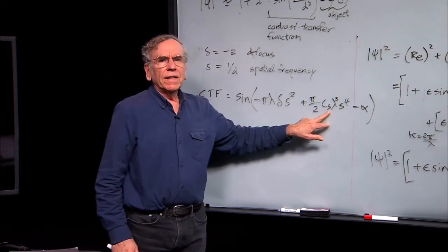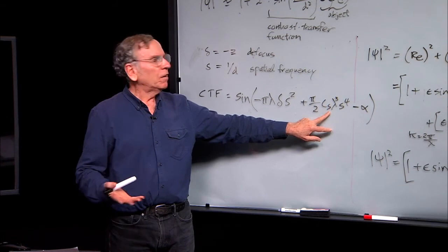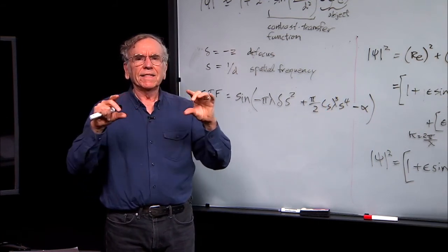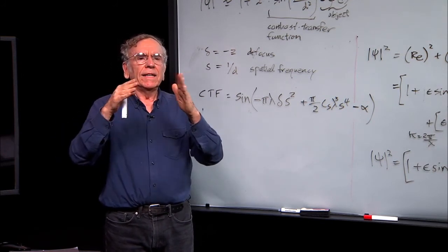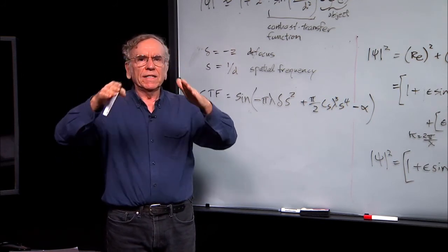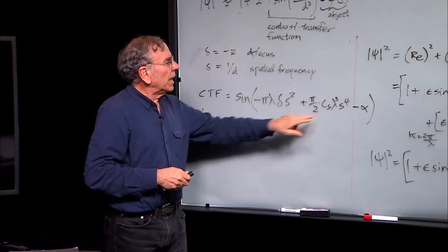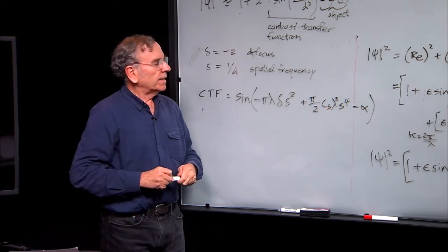So the spherical aberration, there's nothing spherical about the lens in an electron microscope, but it is exactly what people who grind lenses have a problem with when they have spherical surfaces. The idea is that electrons that come at a steep angle and go into the lens get focused too strongly, and it's described by this coefficient Cs.